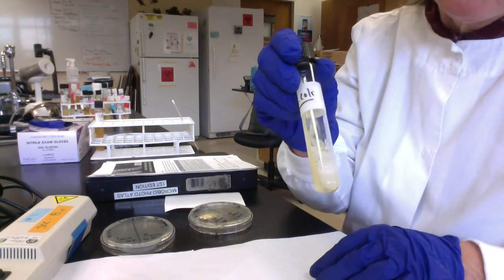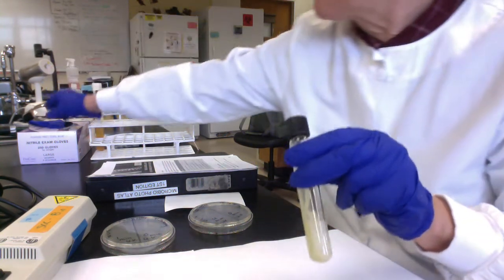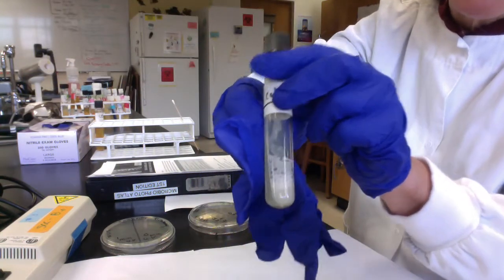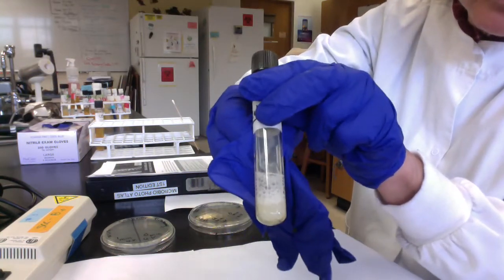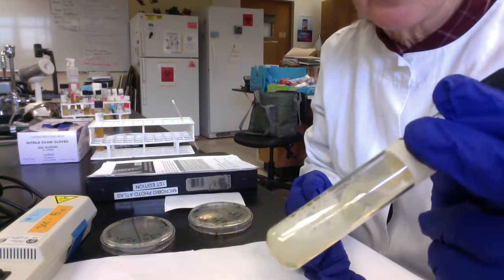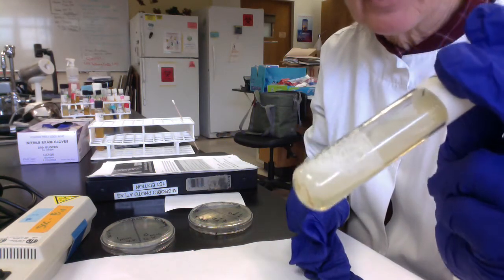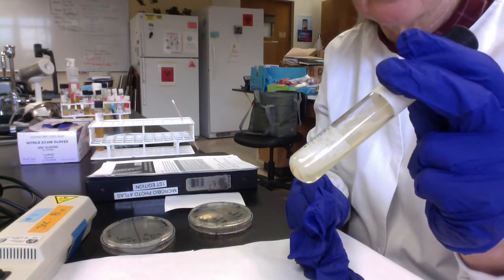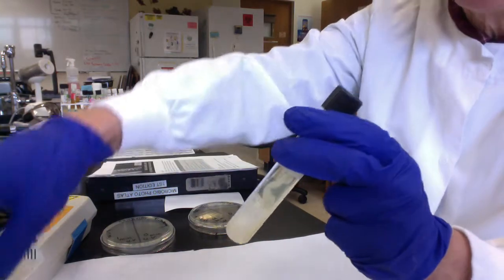This is that catalase test, so it just really went to town. You'll recall that initially when we did it with the Staph Epi, the Staph Epi was old, so we couldn't quite see it. But it just really went to town. I'm hoping you can see what a great amount of gas that positive catalase test produced, and that was using E. coli.